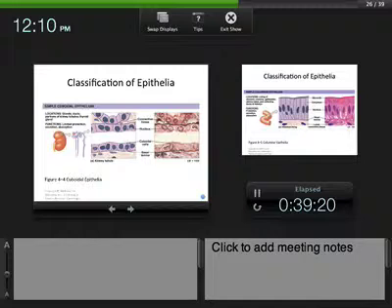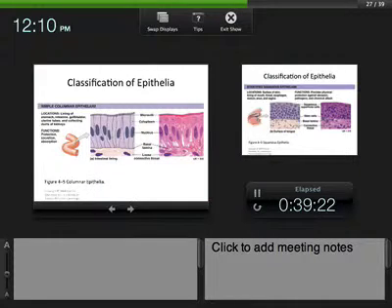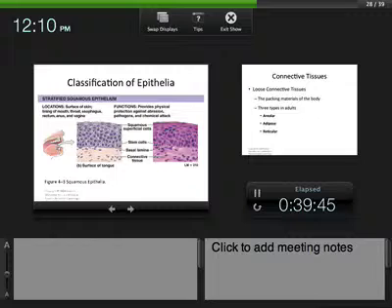Most of the volume of the cell is filled with the nucleus. The columnar epithelial cells, these are found throughout the GI tract and in the female reproductive tract. They are long. They have this layer of microvilli on the surface. Certainly distinctive from the cuboidal cells.